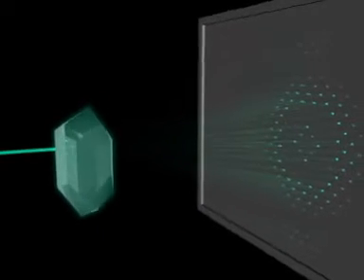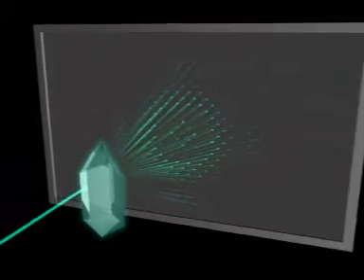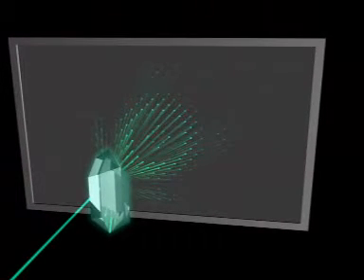In this arrangement there is also a small crystal of the sample material positioned on a goniometer head. This diffracts the X-ray light coming from the beamline in a way characteristic of the internal structure of the crystal. A two-dimensional detector registers the radiation diffracted by the sample crystal. This measurement is repeated several times for different crystal orientations.